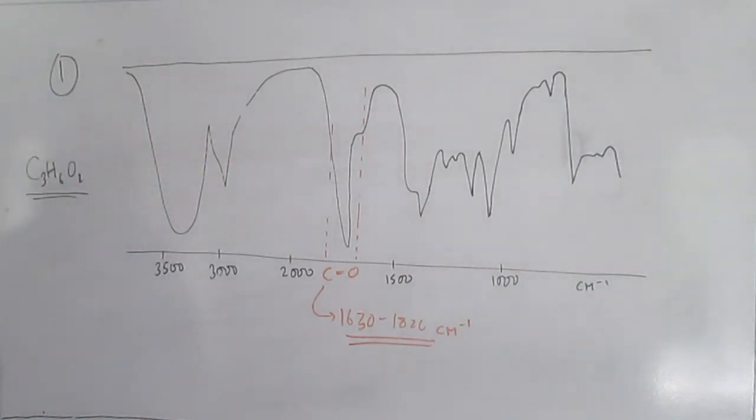The crucial thing is that that's an OH peak, but there are 2 different types of OH peak. If you look on your data sheet, you can see it distinguishes between alcohol OHs and carboxylic acid OHs. The peaks look very different, and therefore you can tell what kind of OH it is. A lot of people ignored that and just said it's an OH, so it could be a carboxylic acid, it could be an alcohol. There should never be that kind of ambiguity if you've got the infrared spectra, because the peaks look very different.